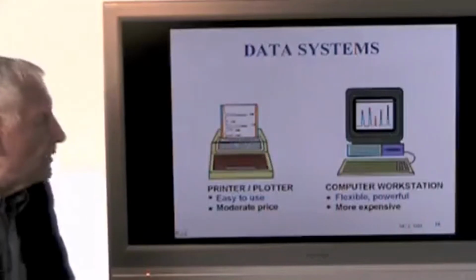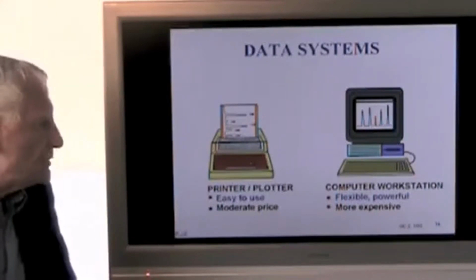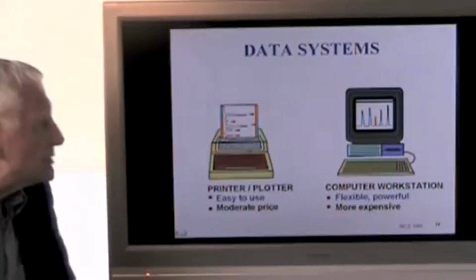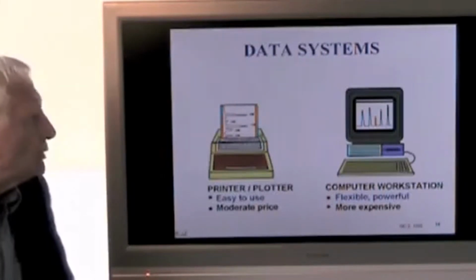Still available, still used widely, are printer plotters, integrators. Easy to use, a more moderate price, and they do give you basically the same quantitative data, but not with the flexibility and the format reporting associated with the computer systems.